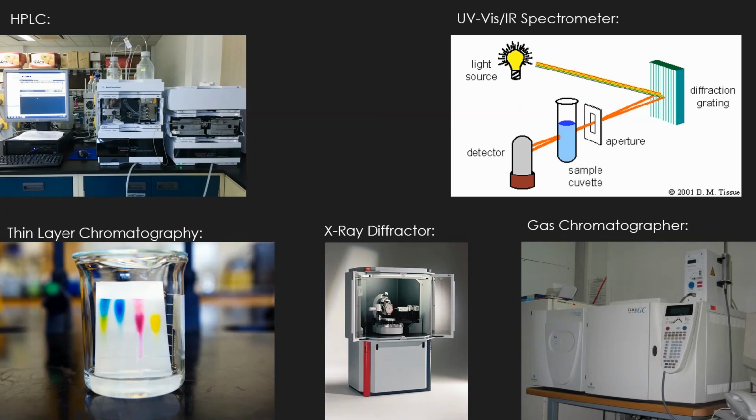HPLC/LCMS is an excellent analytical method used to separate and identify compounds. It is fast and efficient at separating and analyzing compounds without sacrificing resolution and repeatability. This is due to the method being highly automated with reliance on liquid pressure, while also being coupled with sensitive detecting techniques such as mass spectrometry. However, the application of HPLC is limited, as this method can be quite expensive and requires a high level of expertise to properly run this method of analysis.